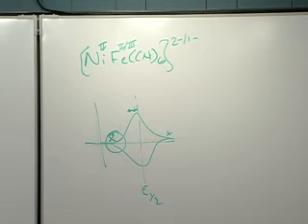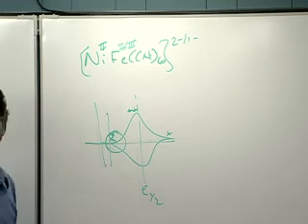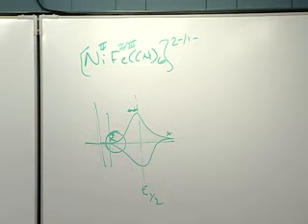So we use a small, say a 10 millivolt AC perturbation sitting at a potential over here, around 0 volts versus SCE. And we're going to look and see what happens to that. And we'll do that as a function of the cations that are present, to see what's happening as we change to different alkali cations. But before we do that, of course, we need an equivalent circuit.